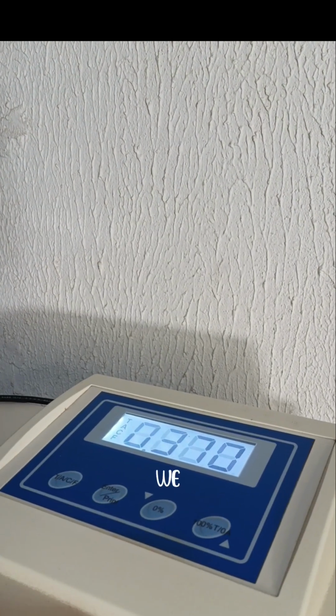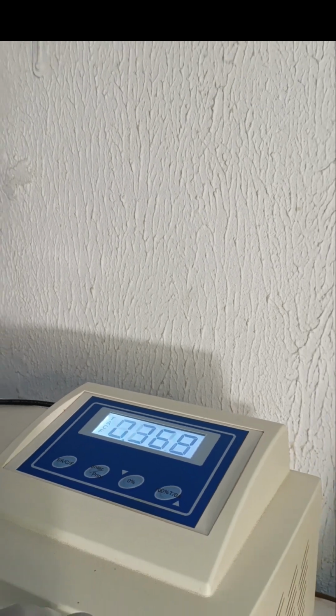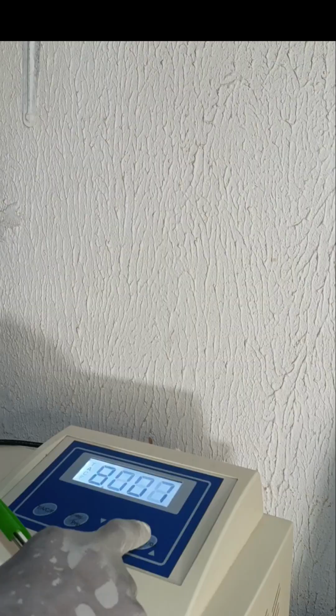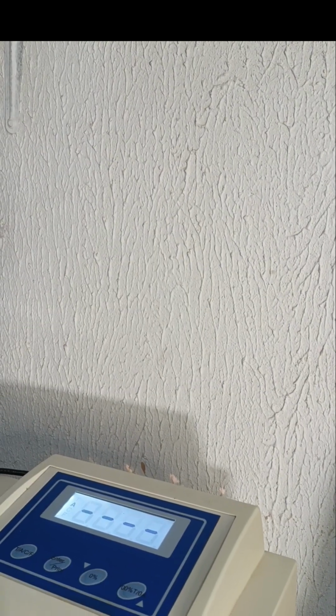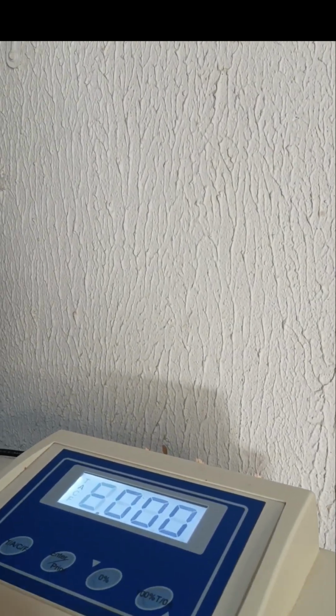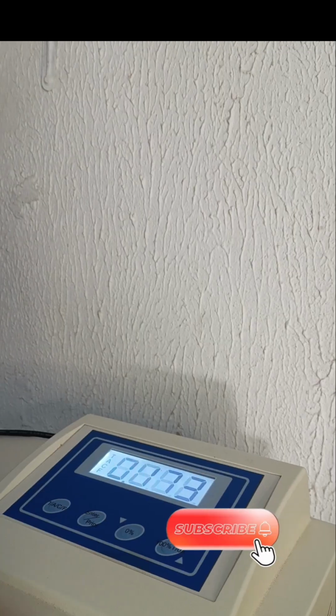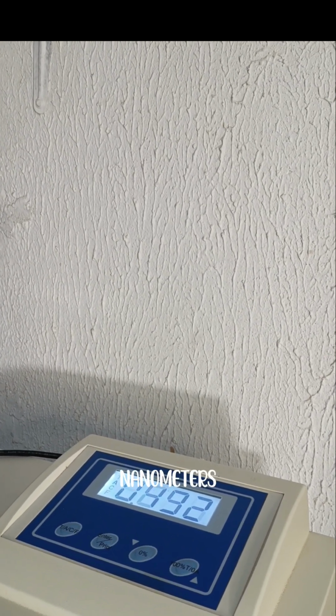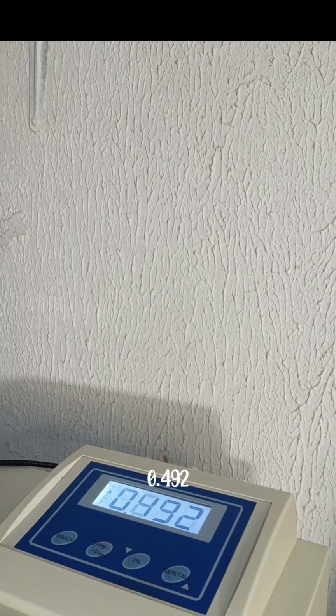We got an absorbance of 0.369. Move to 620 nanometers, and we take our reading. At 620 nanometers, we get 0.492.